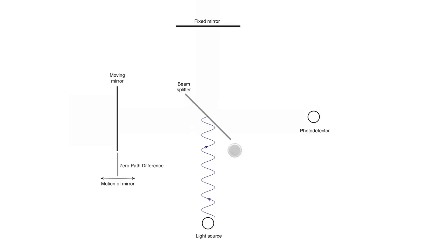And a beam splitter is just a partially silvered mirror. This would obviously be a mirror made of a material that reflects IR light, and the transparent part of the material is a material that lets IR light through. Now we can reflect off that mirror, and obviously we'll reflect in this direction, or we could pass through, since it's partially reflective, toward that mirror. So the light passes through, and then it bounces off of those two mirrors. Those are real mirrors, so the light just bounces off of those and comes back to the beam splitter.